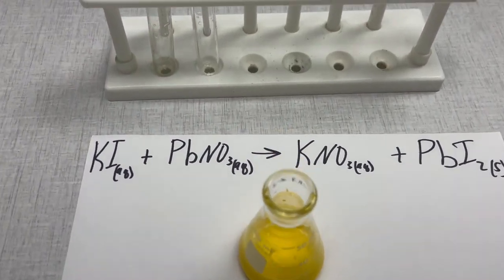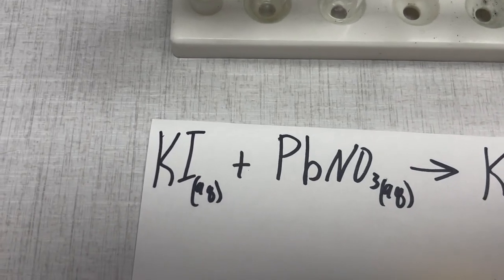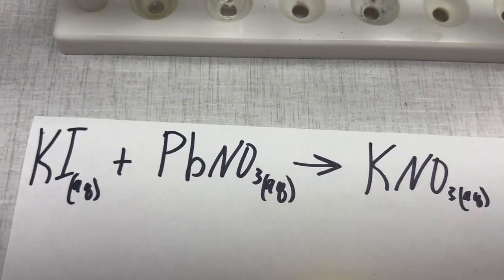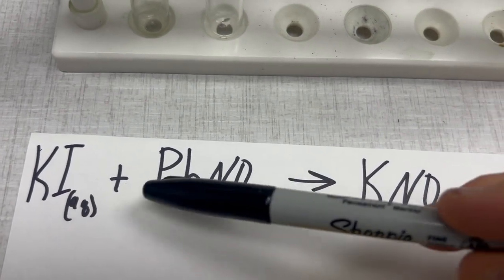So when we run the reaction, we had KI aqueous. We reacted it with the lead nitrate, which is also aqueous. Those are our two solutions here and here.